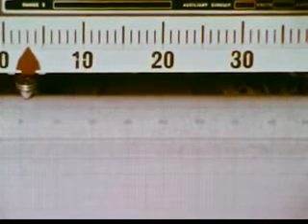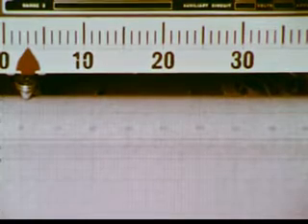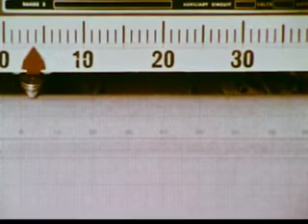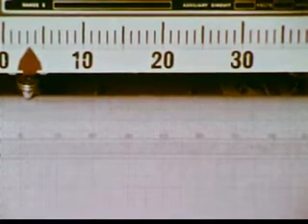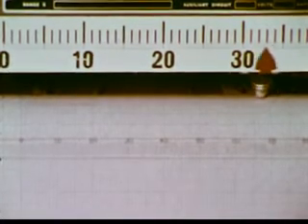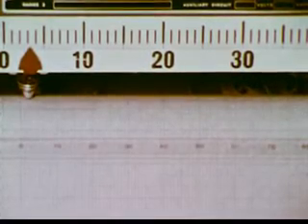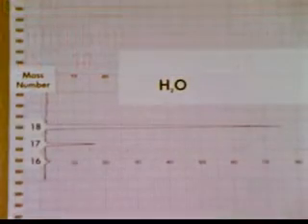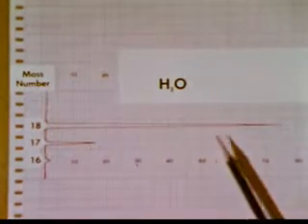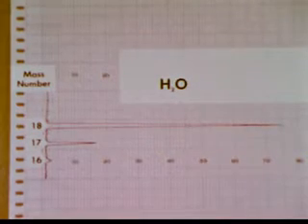There is something. At this setting, ions are striking the detector. And here's something else. Again, ions are striking the detector. This large response must represent a very common kind of ion striking the detector. Let's look at the chart. We see 3 peaks due to mass 16 oxygen ions, mass 17 OH ions, and mass 18 ordinary water ions. No other peaks are seen.